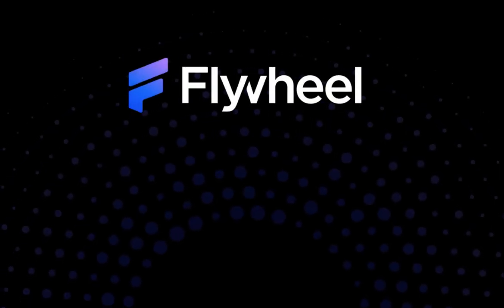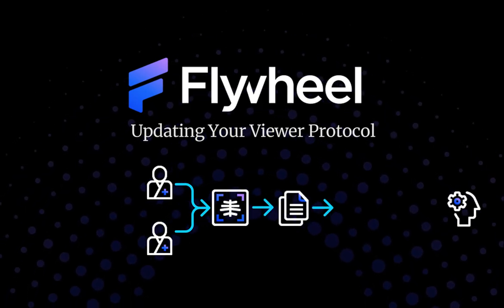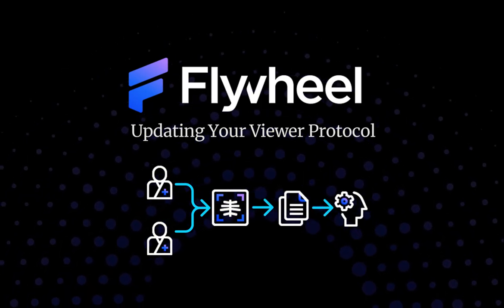For existing viewer protocols, we will now give a brief overview of how to modify the contents of the viewer form, configuration, and protocol itself.